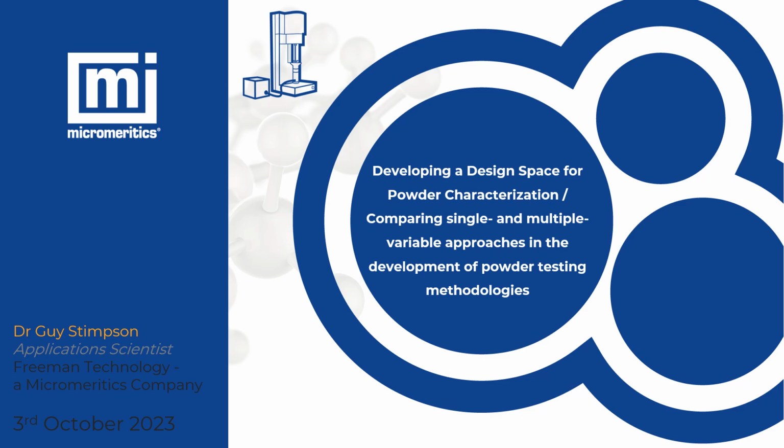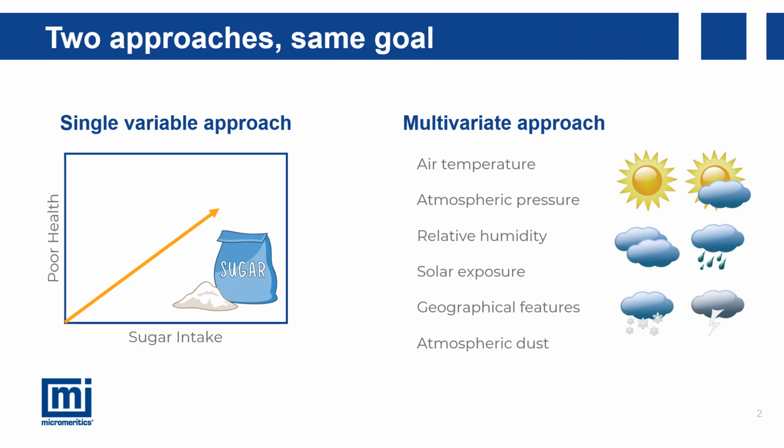My name's Stimpson, and today we'll be examining single and multivariate approaches to powder testing, with a particular focus on tableting and die filling operations. Both single variable and multivariate testing schemes offer pros and cons depending on the system under investigation.